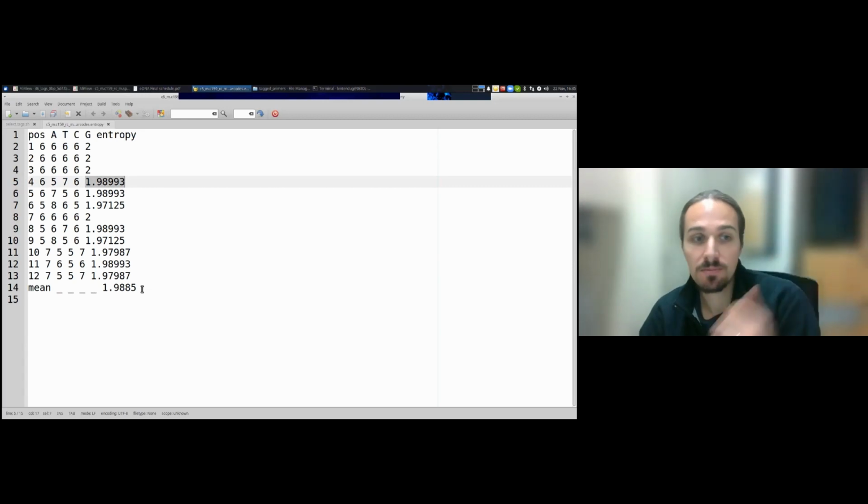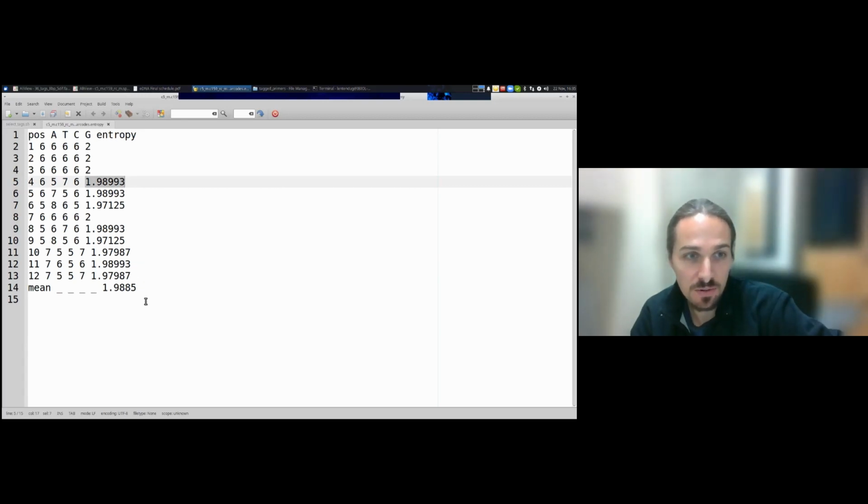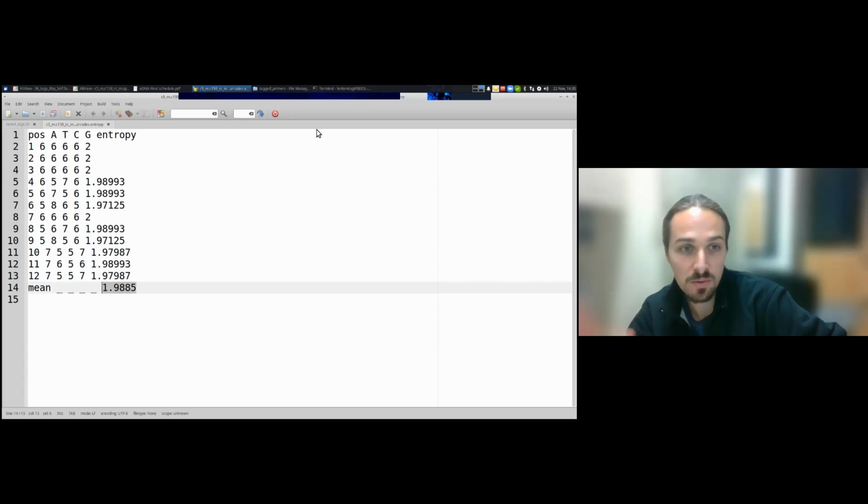And actually, what I've done is to design a loop to select the barcodes and the length of the spacer attached to each barcode, and shuffle them many times until you reach the highest average entropy. That's going into a lot of detail, and you don't necessarily need to do that to add your heterogeneity spacer, but that's the background idea: to maximize the entropy at each position to allow for better quality of sequencing.